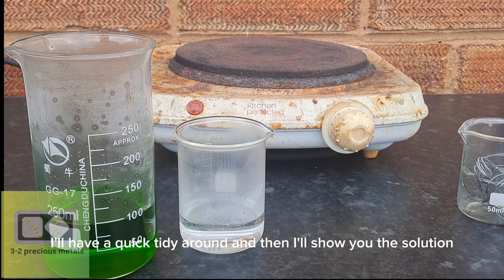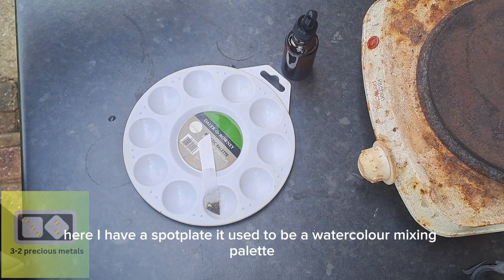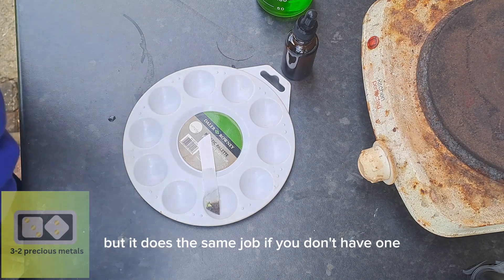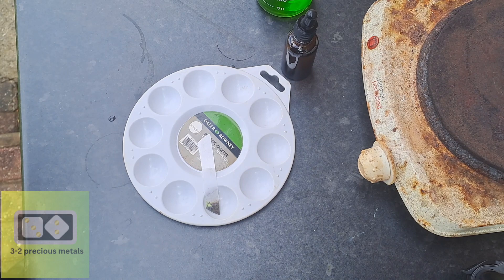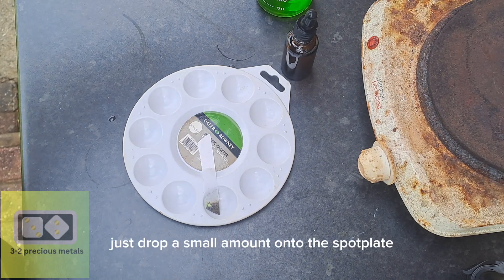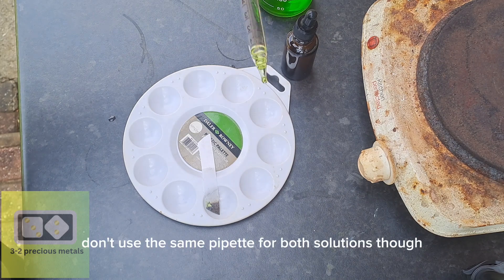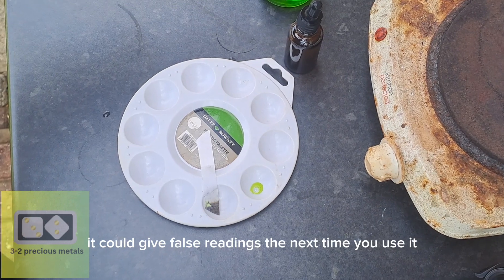I'll have a quick tidy around and then show you the solution working on a spot plate. Here I have a spot plate — it used to be a watercolour mixing palette, but it does the same job. If you don't have one, you can use a white plastic spoon and get the same result. Just drop a small amount onto the spot plate and add your stannous chloride. Don't use the same pipette for both solutions though — you do not want to contaminate your test solution, as it could give false readings the next time you use it.